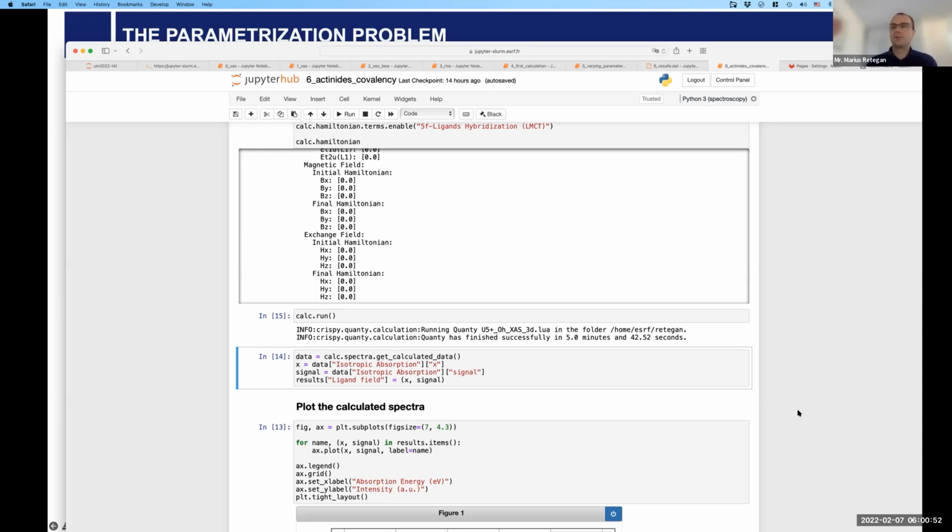Okay. So we have this discussion internally, and this is feedback that is actually extremely useful, because the idea is what to do next. Would we put effort into developing something, because Athena is going to go away at some point, unfortunately, because it is not being developed anymore.